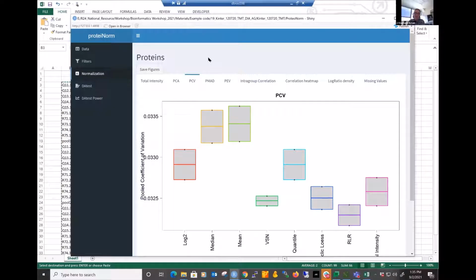Yeah, if you're trying to go across experiments or across instruments, you're definitely going to have an instrument batch effect. You can do that, but remember that this is a discovery phase type of analysis, and you want to validate those findings later. But the limma model has a batch correction in its statistical design. So there's a few different ways to do that.